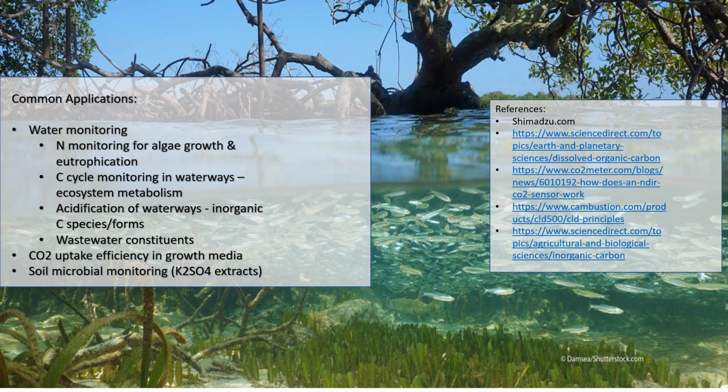and then also people have done studies on how well they can push the carbon dioxide uptake for their algae media, so we've measured carbon rates for them. And then a kind of interesting application: you can do soil extracts with potassium sulfate, and you can measure the microbial carbon cycle that way. So really interesting applications that this instrument can handle.